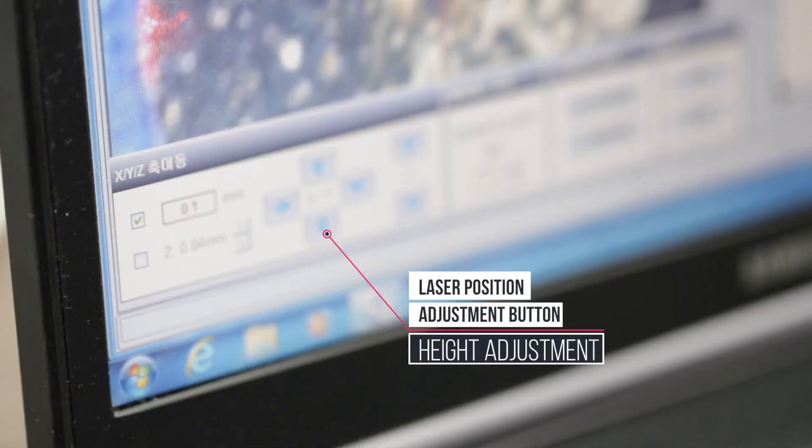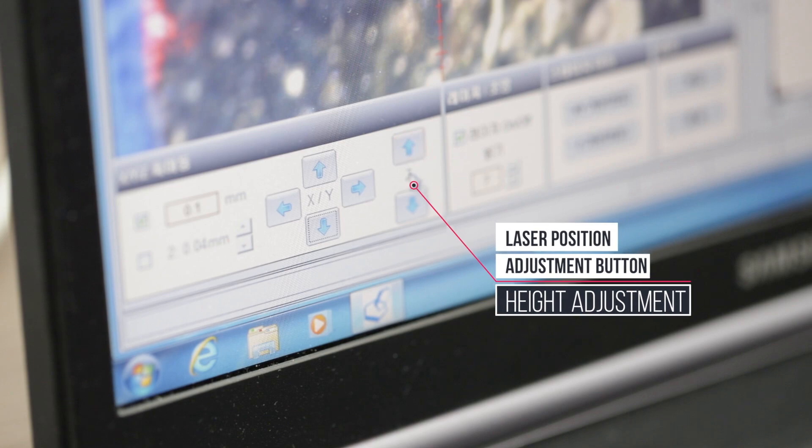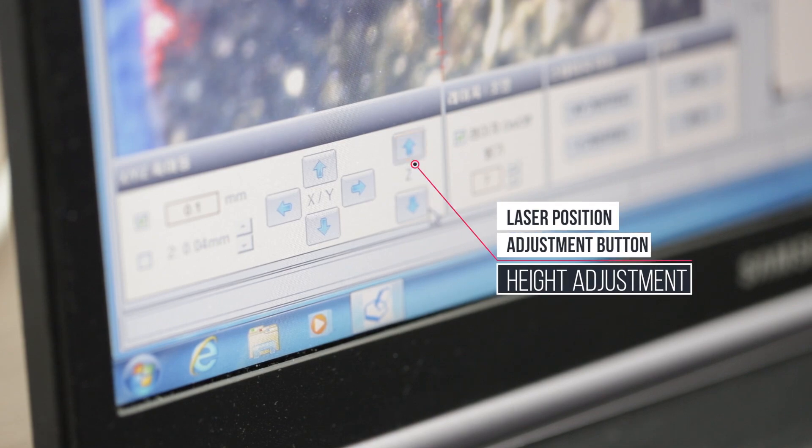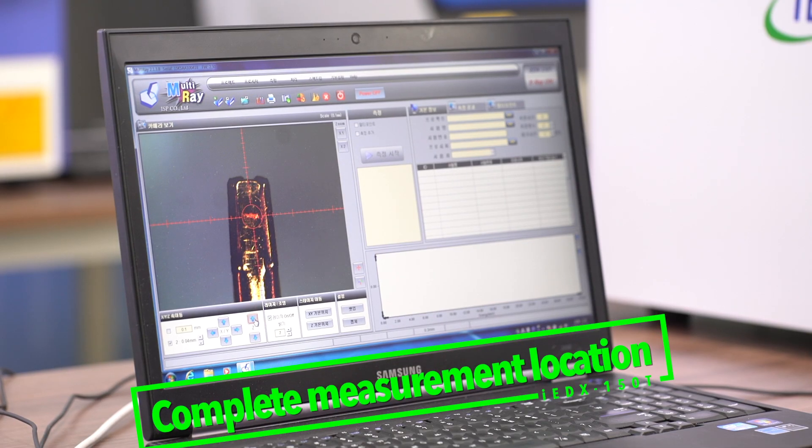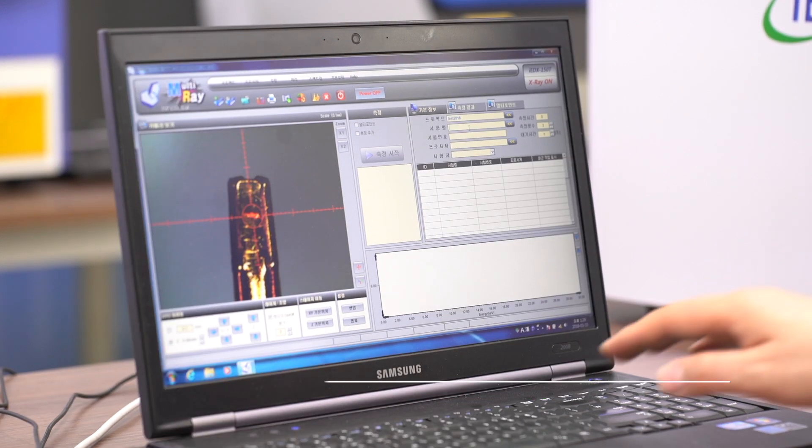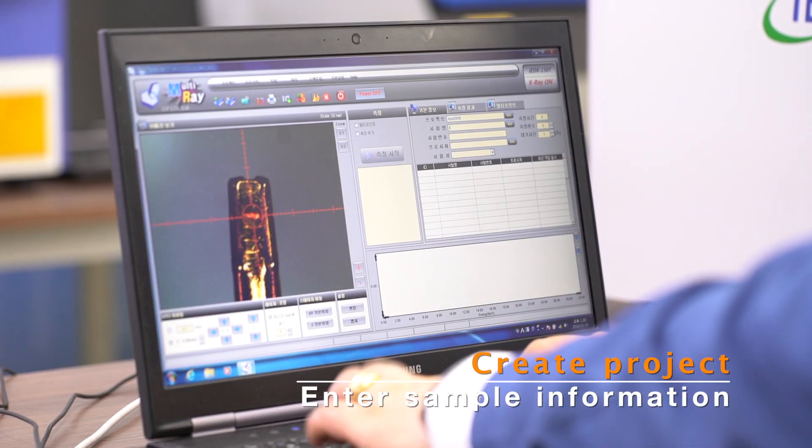You can also use these buttons. Now the measuring position is correct. Create a project and enter sample information.